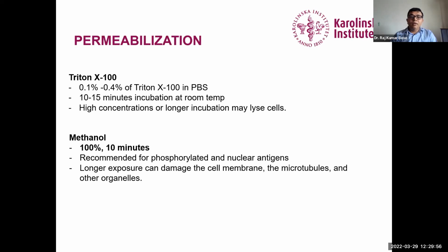And you can also fix cells and permeabilize with methanol. Let's say you fix with formaldehyde, you can permeabilize also with methanol at room temperature. But methanol permeabilization is recommended for phosphorylated and nuclear antigens. And longer exposure can damage the cell membrane, microtubules, and other organelles.